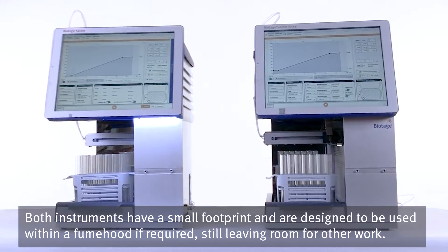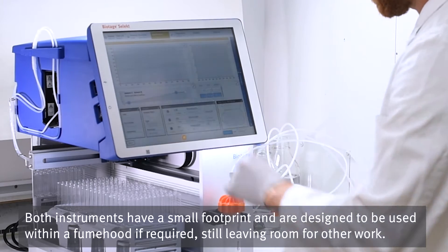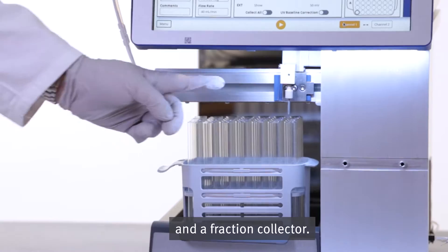Both instruments have a small footprint and are designed to be used within a fume hood if required, still leaving room for other work. Each instrument contains a pump to flow solvent down the column, a detector, and a fraction collector.